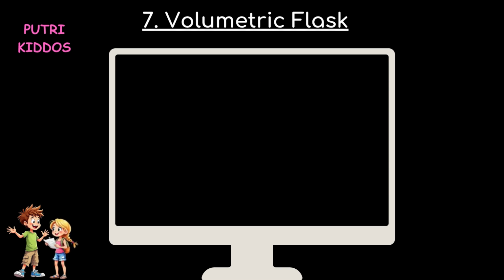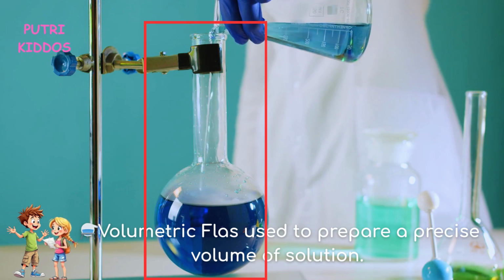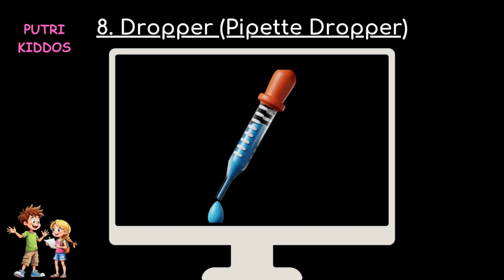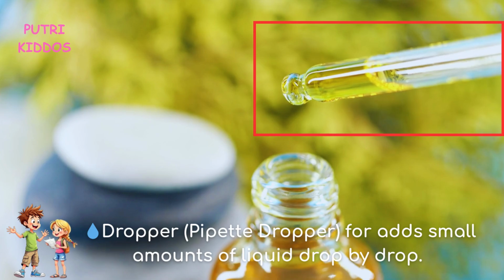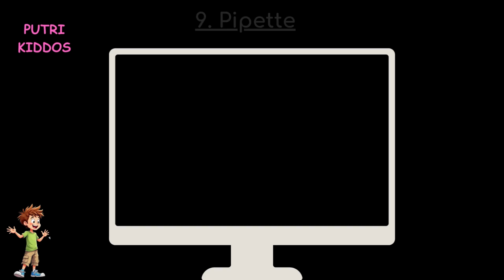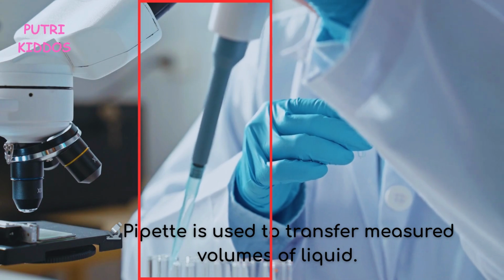7. Volumetric flask. A volumetric flask is used to prepare a precise volume of solution. 8. Dropper, pipette dropper. Add small amounts of liquid drop by drop. 9. Pipette. A pipette is used to transfer and measure volumes of liquid.